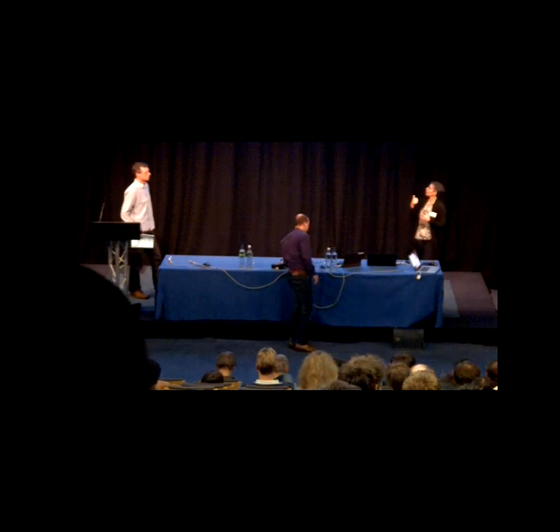I don't know if I brought it up there, it's a post-mortem analysis, though. So sometimes you need to know if the model is good before you actually get the solution. So even the RMSD is a post-mortem analysis. So that's good to kind of evaluate it at the end, to say, okay, I used these many models, these were similar or different, and this is a little better way to do it. But I don't think it helps you in identifying the model that you want to use.